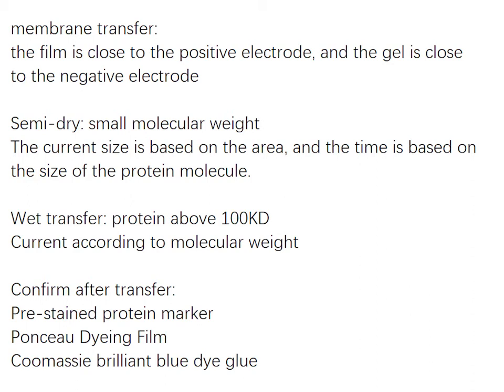There are two common ways for the membrane transfer, and the first is semi-dry and the other is the wet transfer. After transfer the membrane, we can confirm it through pre-stained protein marker or other stains.